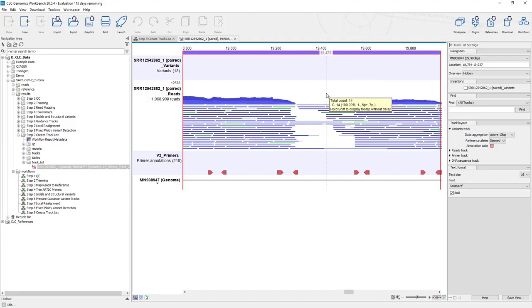It's great when you're looking at one sample, but it's even more powerful when you're looking at a number of samples together. But before we get to the large number of samples together, there's still a few more things that we want to iron out, which includes a simpler version of this. You don't always need the read mapping here. Sometimes all you really want is the coverage graph up top.